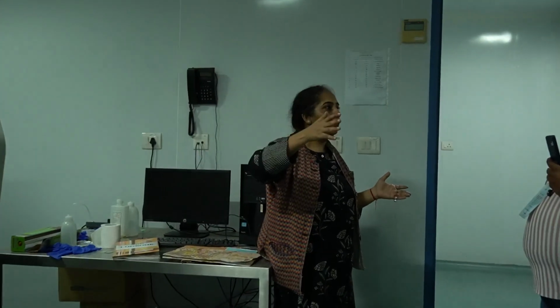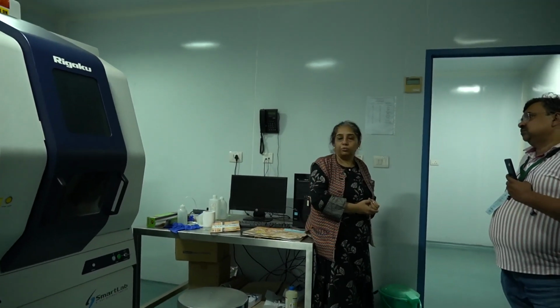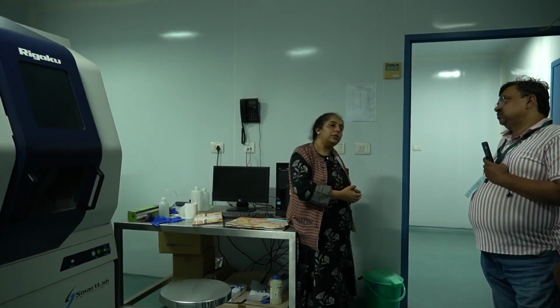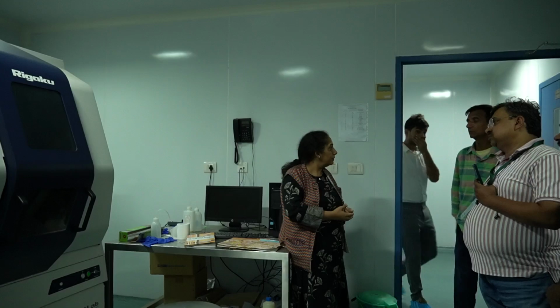Matching has to be there between the source we are using and what we are seeing. Like where to use a knife and where to use a sword. It depends upon what you want to see, so the tools should be of that resolution only. So the first point is that this is used for the determination of crystal structure. Whether the material is crystalline, amorphous or polycrystalline, all these 3 can be determined through X-ray diffraction.